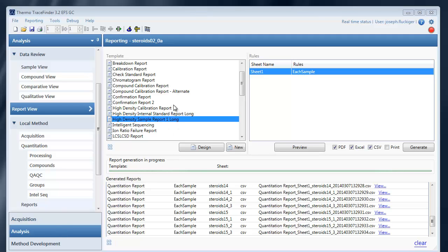So here you'll see the list of templates and to open a template you can either double click or hit the design button.